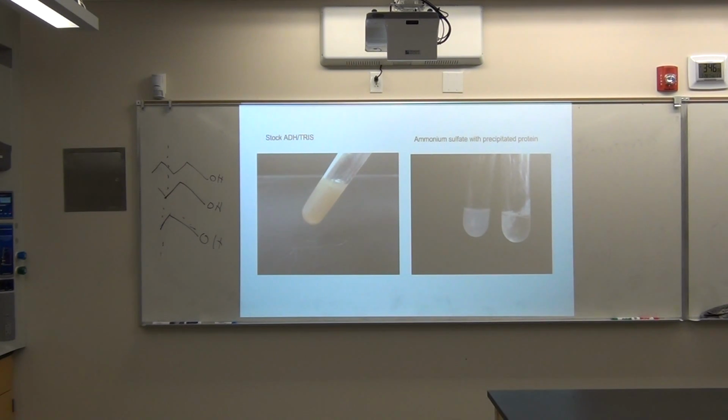It's like literally, what is it, John? It's like $150 for 50 milligrams. 50 milligrams of purified ADH. So we had to buy the centrifuge and make our own from Baker's yeast. You get a big old thing of Baker's yeast for 59 cents. But we ran that in the past, and just the temperature change from running those speeds killed it.